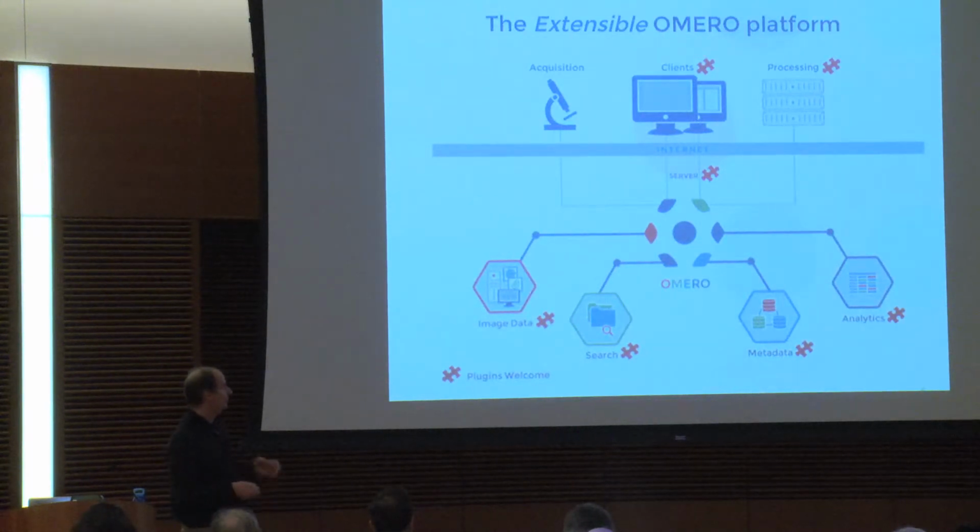Furthermore, the OMERO is actually extensible on every layer of the cake, so to say, so that on every diagram where you have the red puzzle piece, you can write plugins. Plugins is probably too easily said, but let's say extensions, scripts, which are further extending the application.